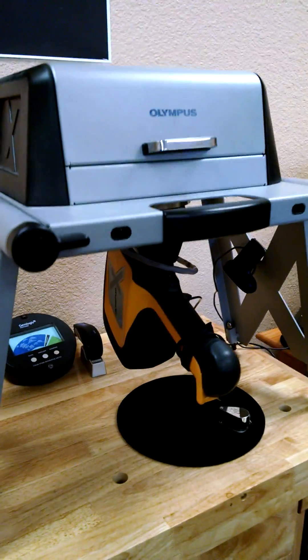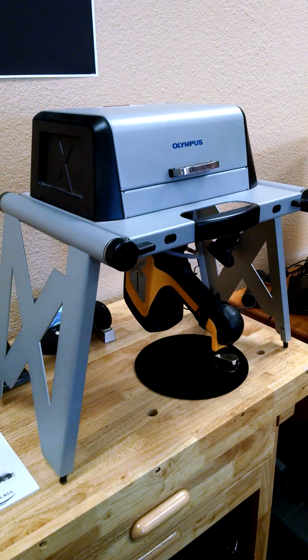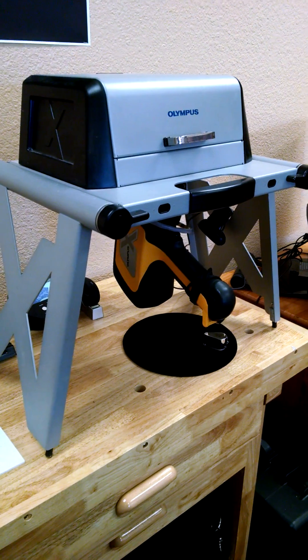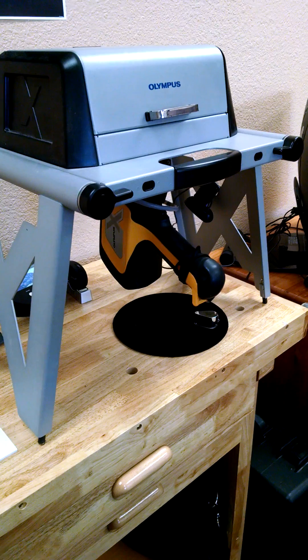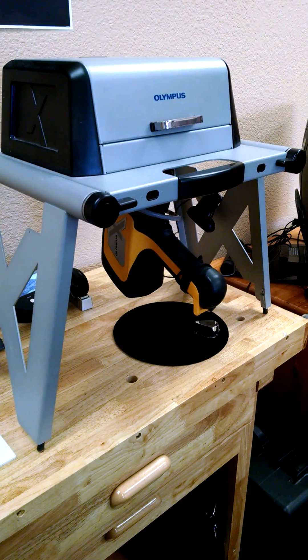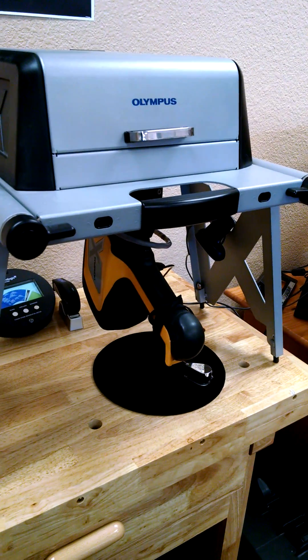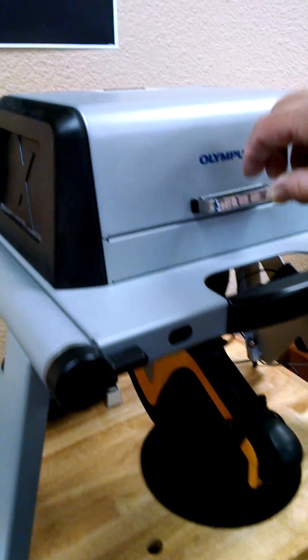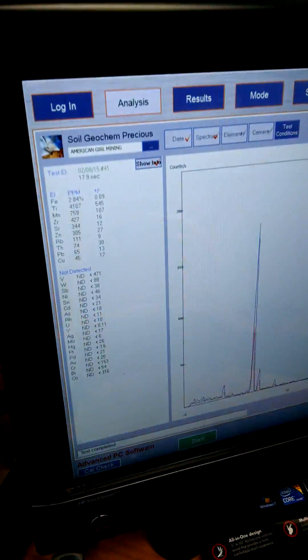We're using an XRF sampling machine — XRF stands for X-ray fluorescence. It actually analyzes the material by shooting it with X-ray. It's got a couple of different beams. We're setting it up for two beams today, running about 90 seconds for the analysis. We'll put the sample in the machine and control it over here on the computer with our software.